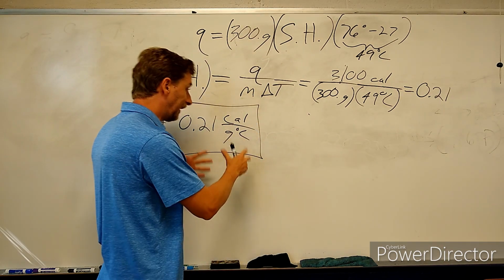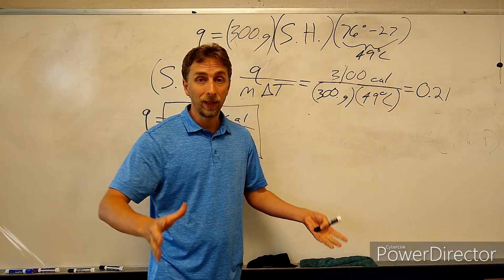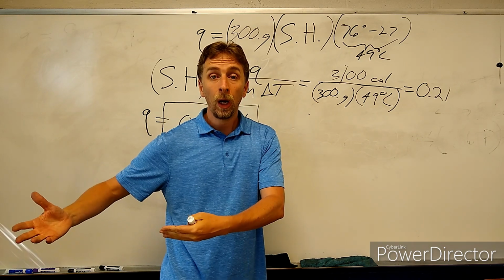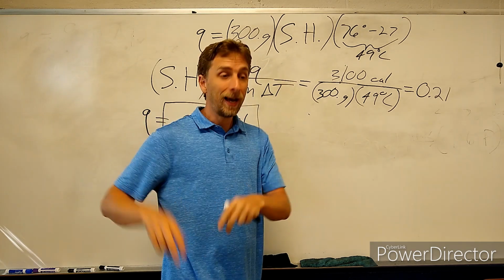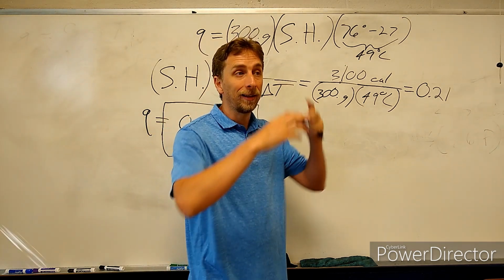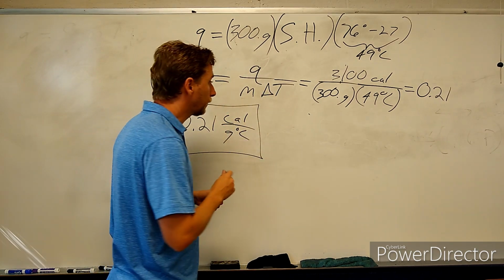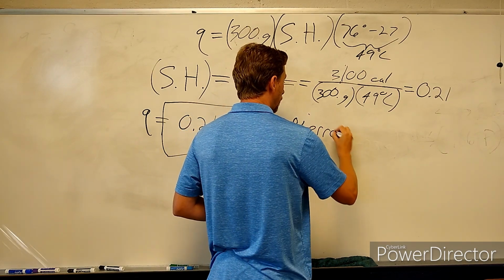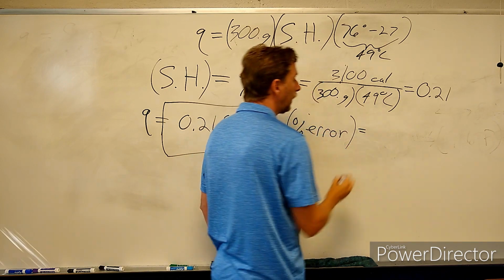This last part is a pretty standard calculation you do all the time for labs, because you're going to get your experimental result and compare it to other people's experimental results, or to the accepted value, which is other people's experimental results that have been accepted as the accurate, true result. A common way to do that is percent error. This is very useful. You need to know this for many different labs coming up. It's very easy. You just plug in.